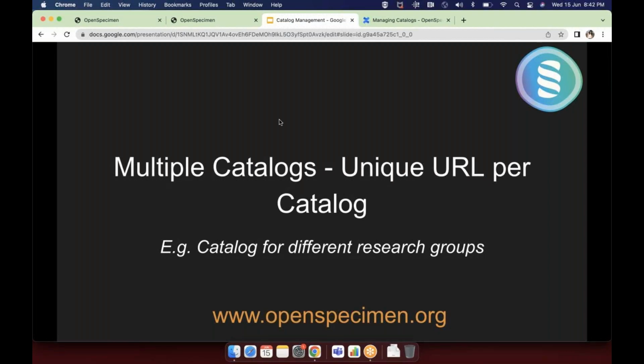The use of multiple catalogs, basically, is that you will be able to have different data sets as part of each catalog. Each catalog can have different configurations, different request forms, different request managers. Based on whom that data is targeted for, you can have different types of catalogs.